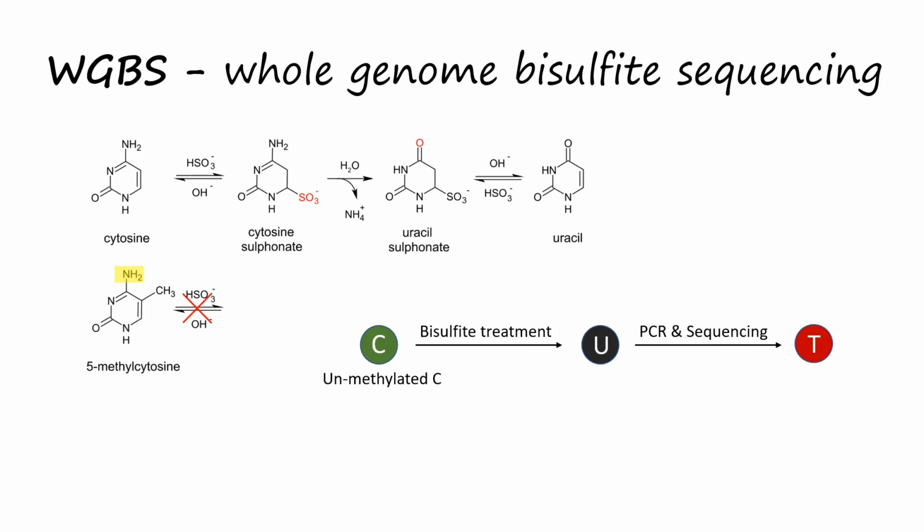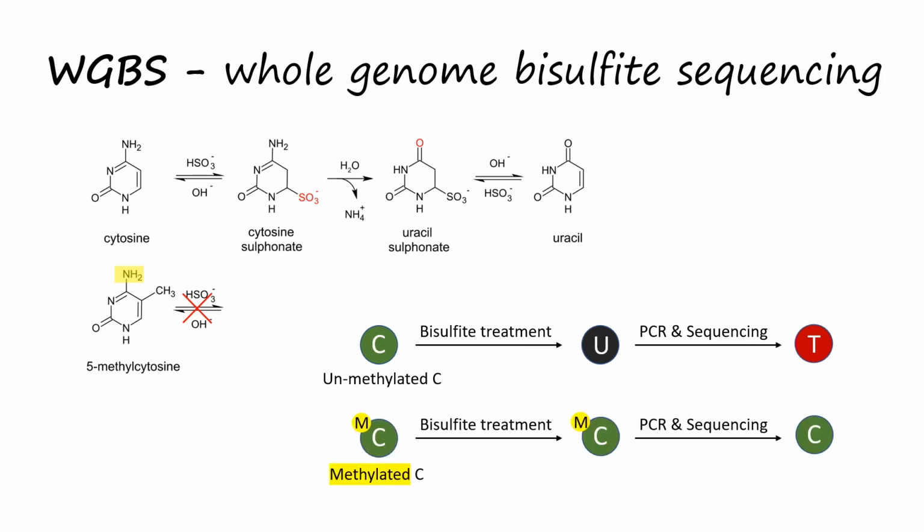Simultaneously, methylated cytosines resist deamination and are still read as cytosines. In this way, the location of the methylated cytosines can be determined by comparing treated and untreated sequences.